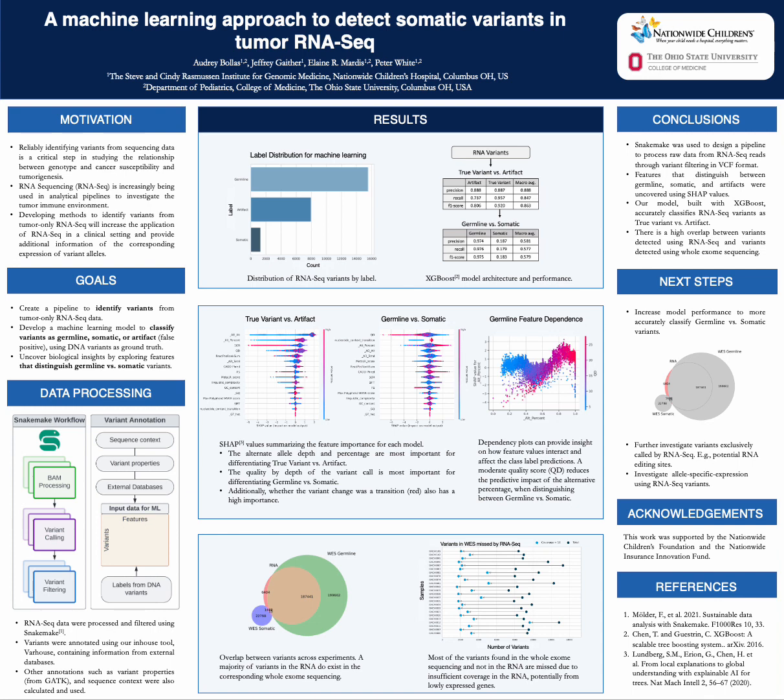So we did investigate this further. This plot on the right shows the variants in whole exome sequencing missed by RNA-Seq. So the darker blue dots are the total variants broken down by sample on the y-axis. And then if we actually reduce this number just by the coverage value, so if the variants in the RNA-Seq did not have a coverage of at least 10, there we can actually see much fewer variants. So this is the lighter blue dot here.